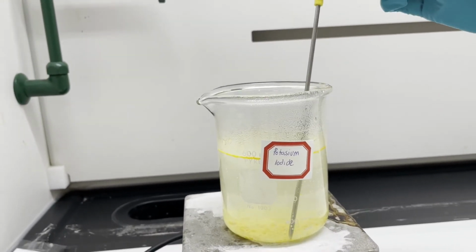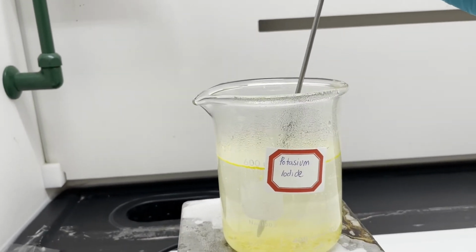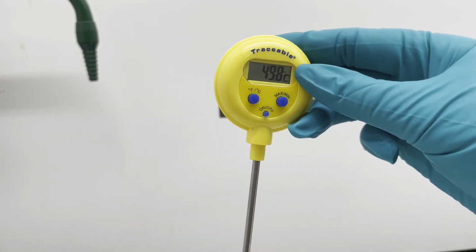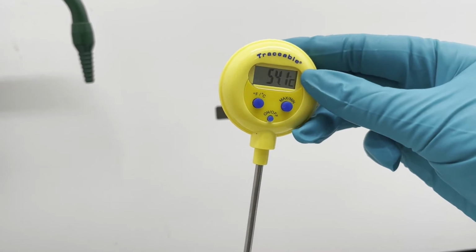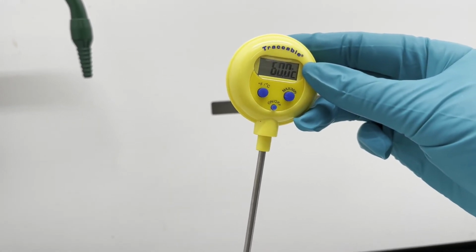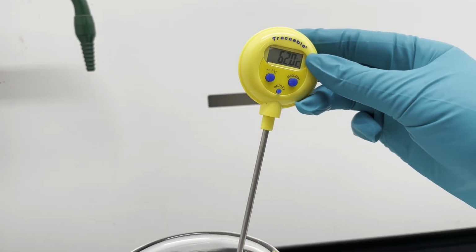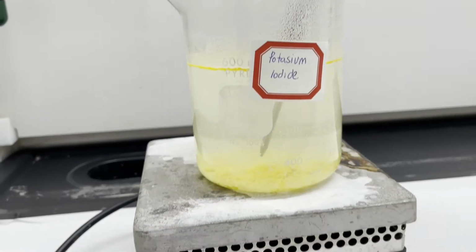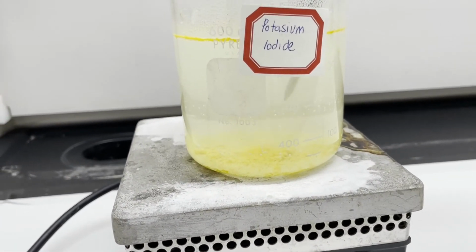All right, so we're going to measure the temperature of the solution now. And once it's reached about 70 degrees Celsius, mostly clear with some yellow precipitate at the bottom, we're going to now remove it from the heat.